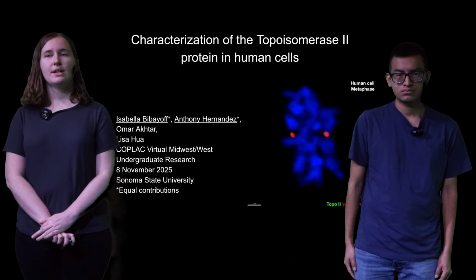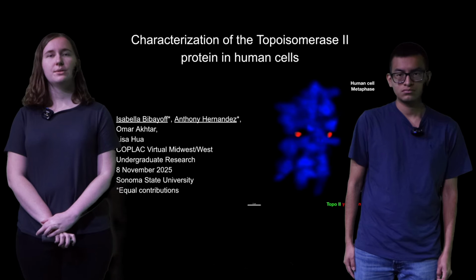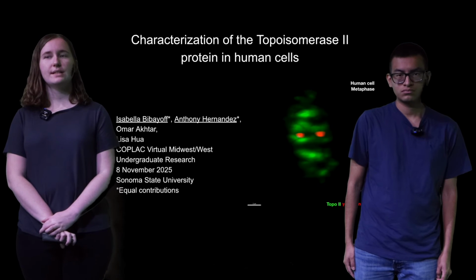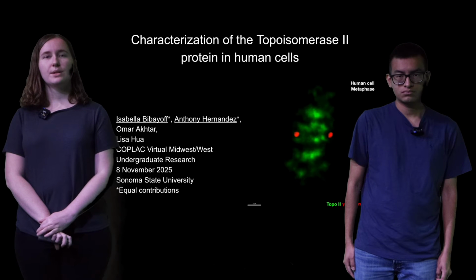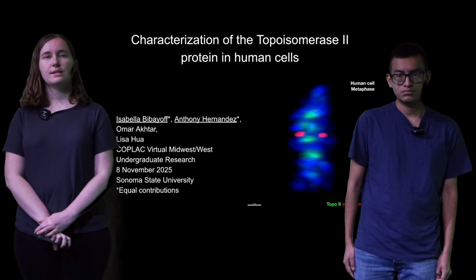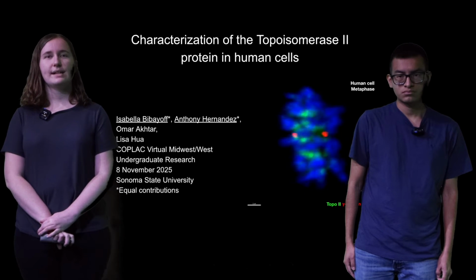We're presenting on the characterization of Topoisomerase II in human cells. What we see to the left over there is a metaphase human cell rotating through, and it's showing all the different channels. All you can see there is just the DNA cloud.